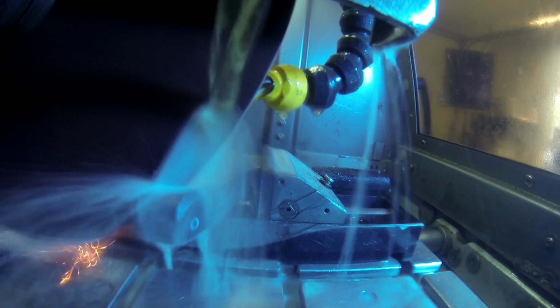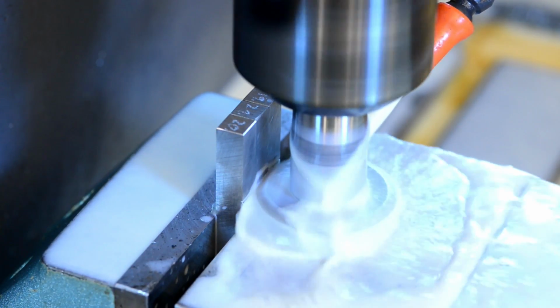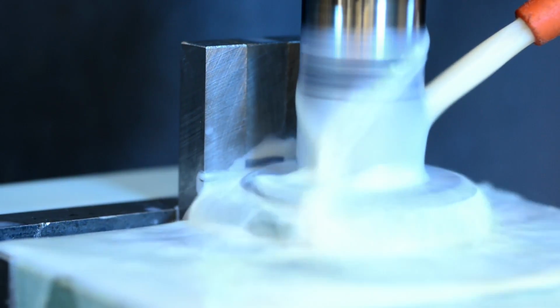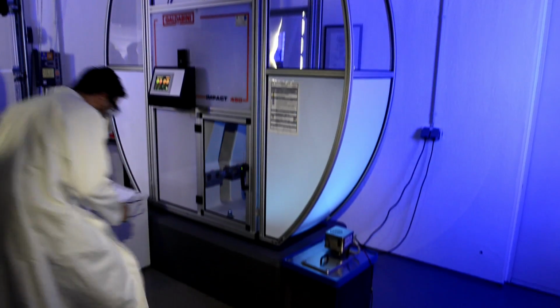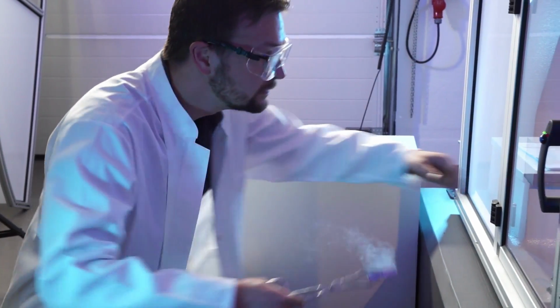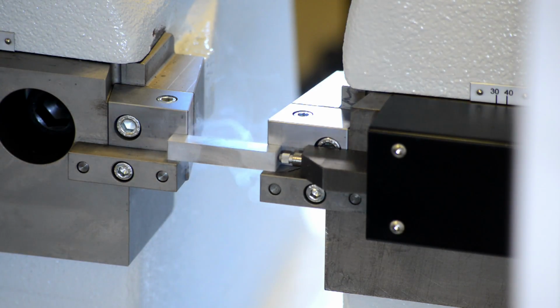First, the defective forging is tested for toughness. For this purpose, a test piece is cut from the defective component and processed into a standardized sample using a surface grinding machine. The sample has such an appearance. It has a dimension of 10 by 10 by 55 millimeters and a corresponding depth groove of 2 millimeters. And this is a standard compliant sample, which must be produced in this way. Cooled to minus 20 degrees, the sample is smashed in a standard pendulum impactor to determine the toughness of the material.